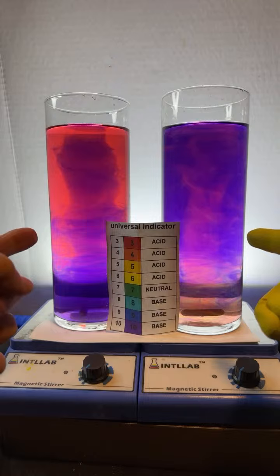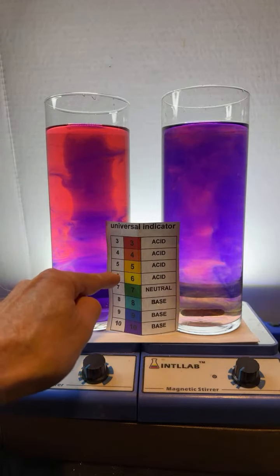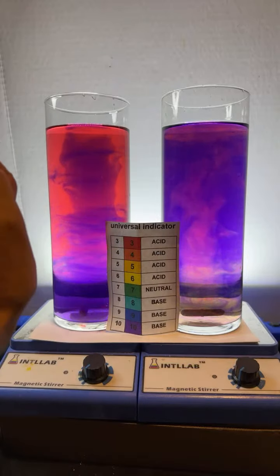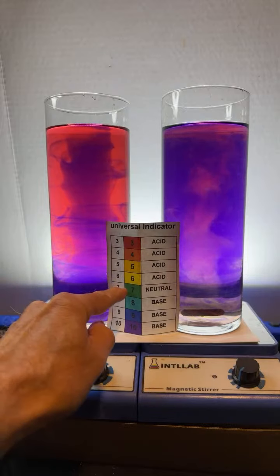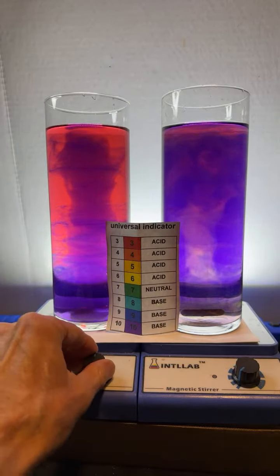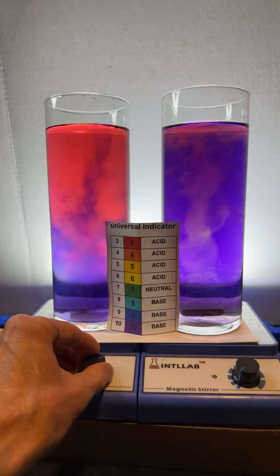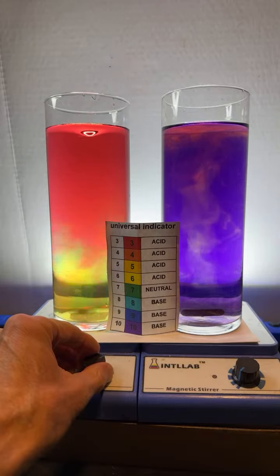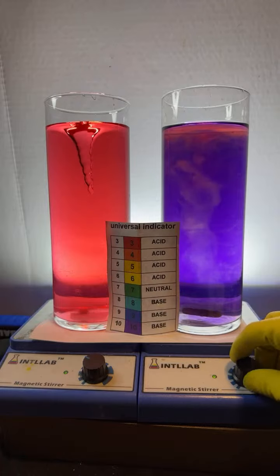So as I spin them, if we have an excess of acid, it'll be yellow, orange, or red. If we have an excess of base, it'll be aqua, blue, or violet. And if it's neutral, if they exactly balance each other, it'll turn green. Let's find out. Here we go. It looks like we had an excess of acid over there on the left. Let's see what happens over here on the right.